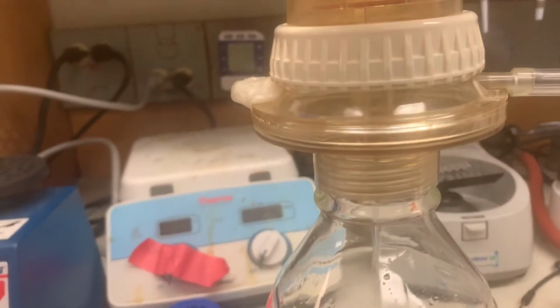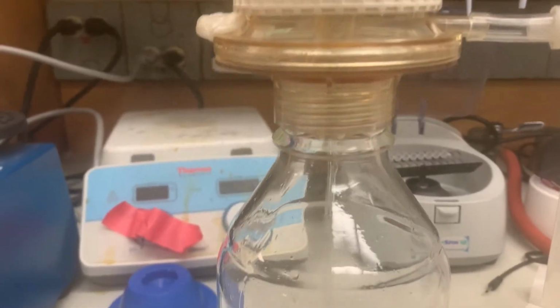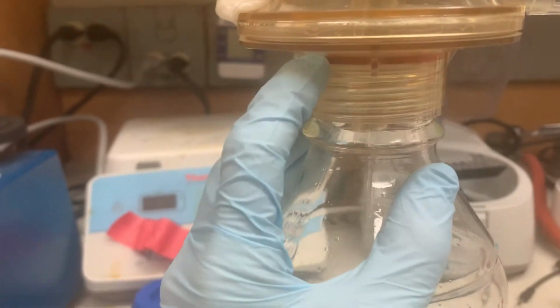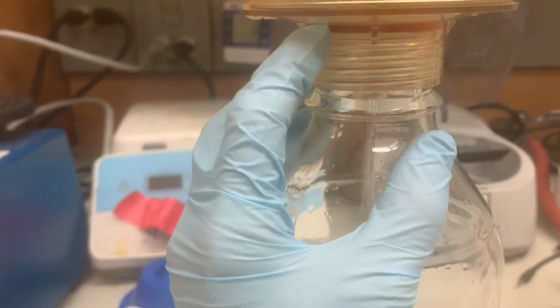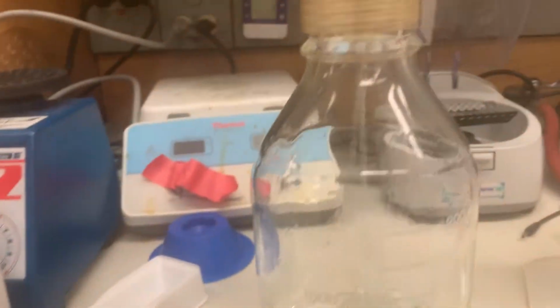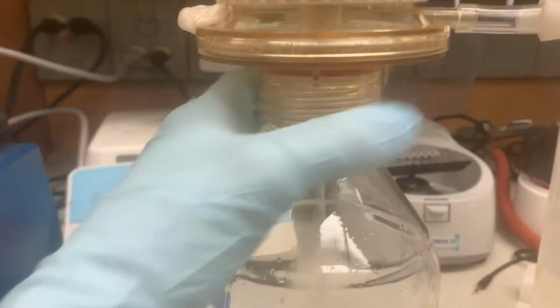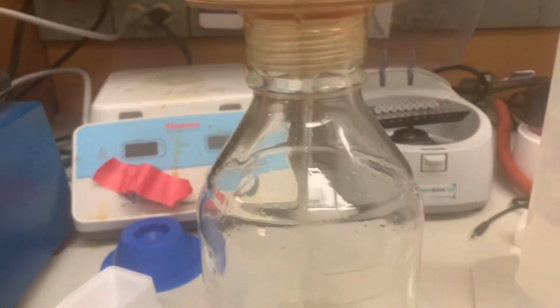You also, if this part's not sealed well, you'll get a crazy, really annoying noise. Sometimes if there's a chip in the top of the bottle, you'll get a bad seal. In those cases, what you can do is take a piece of parafilm and wrap it around to try to get a better suction.